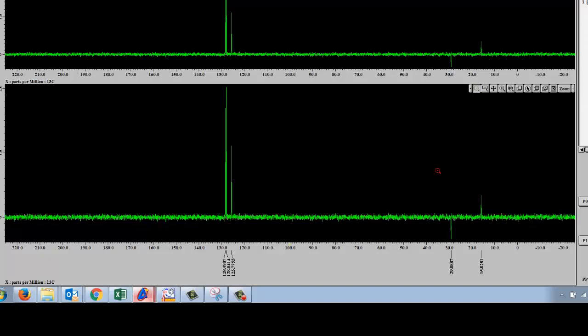Also, the signals are usually a little bit weaker, sometimes a little harder to scan, especially the carbonyls, which show up over about a 150. So if your sample is very, very dilute, you may not actually see many peaks, and it may be hard to distinguish your peaks from your baseline with all this noise. So you want to make sure that your sample is pretty concentrated.